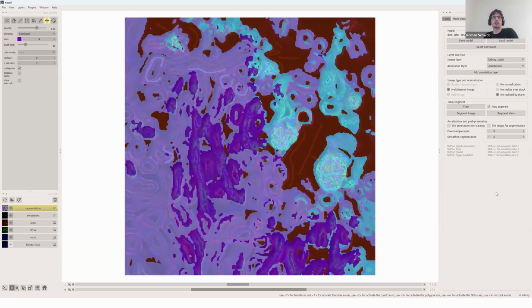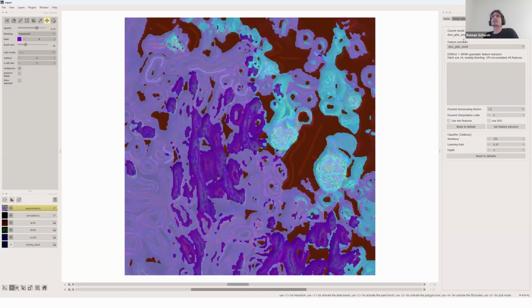There you go. So it looks much smoother, but it's still not perfect. So now we would have to really choose the best model. This is really an empirical process as well. But we believe this exactly shows why we chose to create Convpaint in such a modular way, because we believe there is not one model that works for everything.